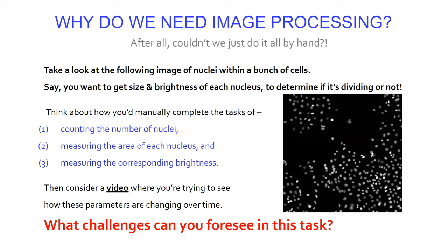Hi, this is Sutpal. I think you might need to extract information that cannot be seen by the naked eye sometimes, so that you can use a machine to interpret that information for you. That's one of the reasons you need image processing. Once you extract the information, you can perform operations on it, from simple operations to the most complex. But in order to perform that, you need to extract the information, and that's where machine processing comes into action.